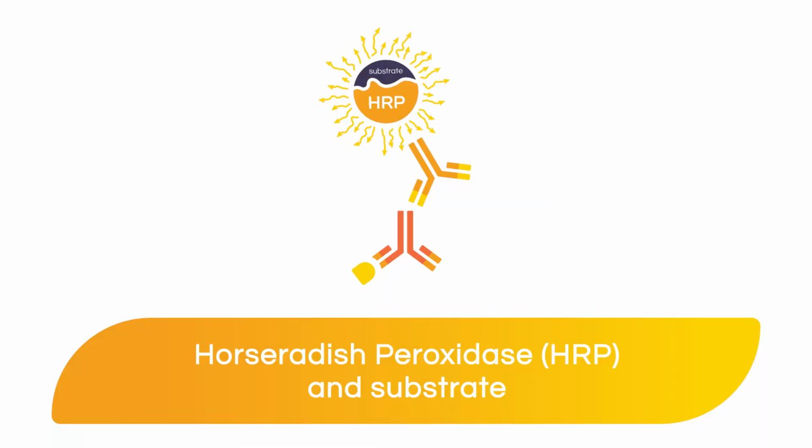On top of that, your secondary antibodies are generated in a specific way so that they will recognize only the Fc region of your primary antibody, which ensures it will not affect the binding of the primary antibody with your antigen of interest. Secondary antibodies can be labeled with different molecules. For example, they can be labeled with an enzyme such as Horseradish Peroxidase, which is also known as HRP.